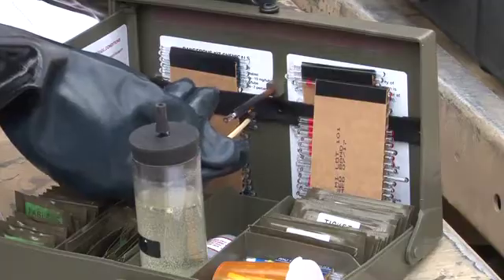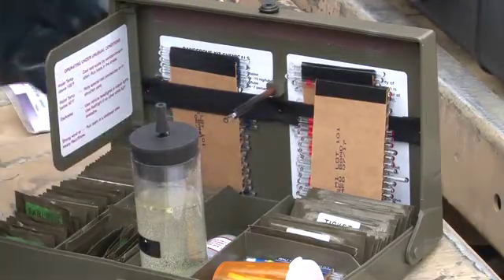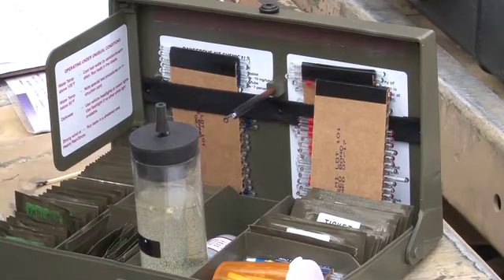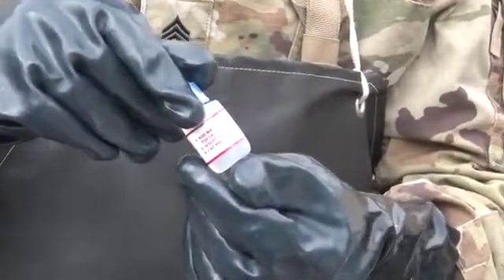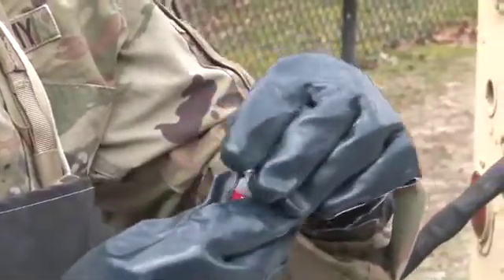Be forewarned that the alkaline chemical that you are using is extremely hazardous. Do not get this anywhere near your eyes or your mouth. One drop of this can cause serious damage. Next, you will remove the alkaline solution bottle from the case and unscrew the cap.